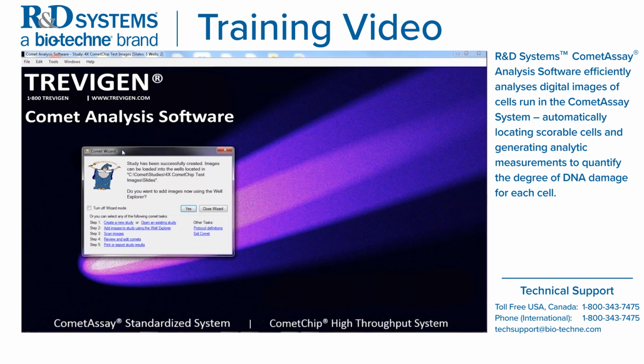So the Comet wizard comes up, and he's very helpful trying to navigate the software. And what you want to note initially is what we're doing here is in that first step, we are creating a special folder, which we called the study name 4X CometChip Test Images. And this is where we're going to store our images so that the software can analyze it. The wizard is asking, do you want to add images now using the Well Explorer? So let's select yes.